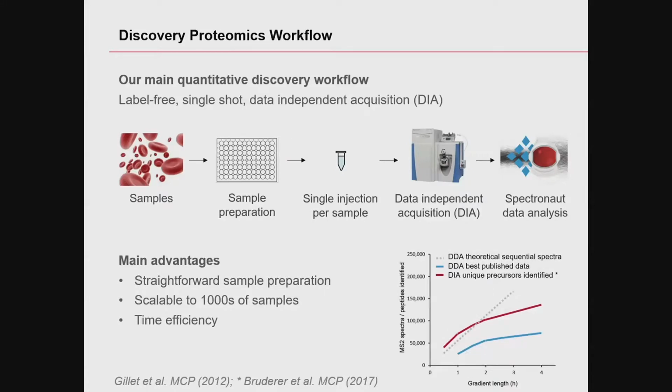And using this workflow, we basically published this last year. Maybe one hallmark to mention is that we were able to quantify more precursors than you can theoretically do on an HF instrument using this workflow. So you can see that it's what I mean with efficiency in terms of quantitation.